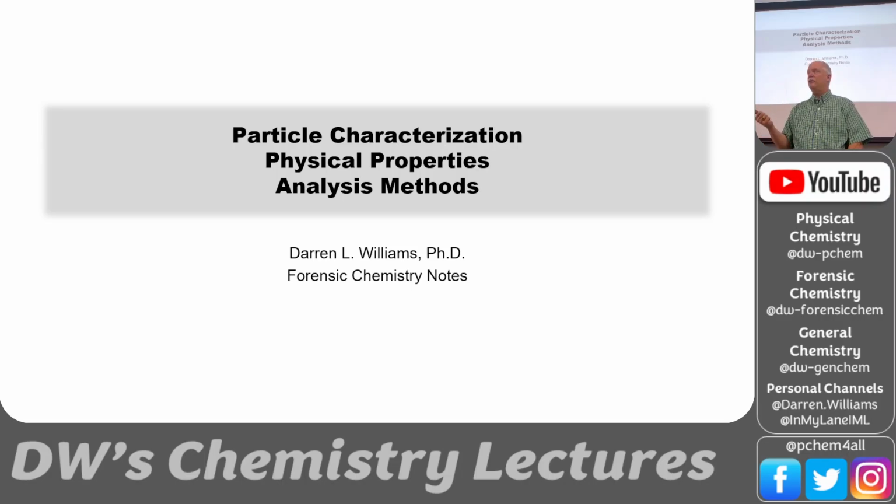We've talked about fibers, we've talked about polymers, we've talked about the physical properties of powders and so on, with color. This again is a physical property, but now we're talking about the size of the particles, and there's a lot of information that can be gained from that. So you could have two powders that have the same chemical structure, and we'll see that today, and based on the way they were prepared, you'll see dramatically different particle shapes and sizes. We call it morphology. So let's jump in.